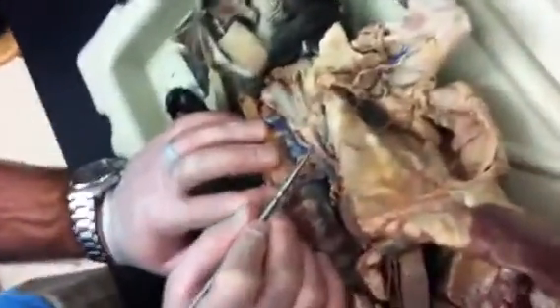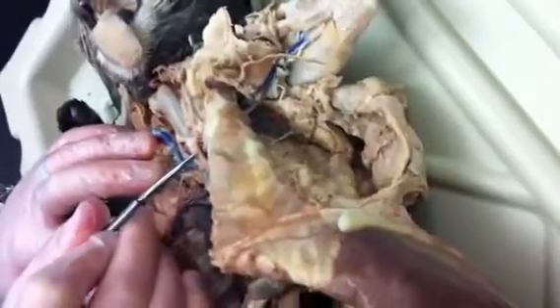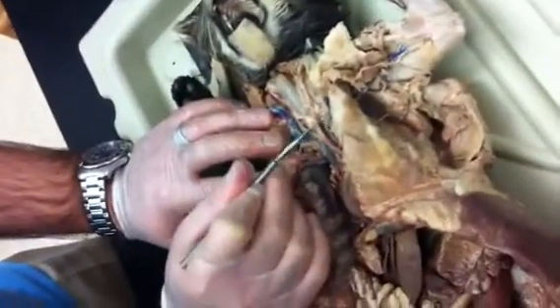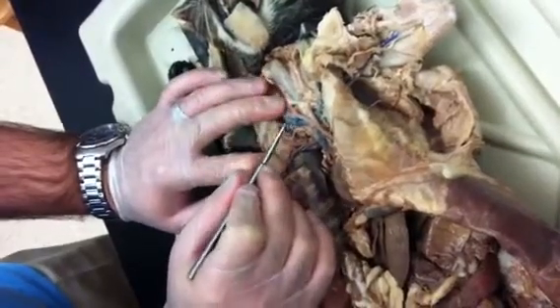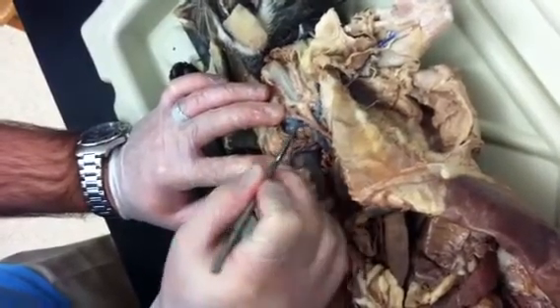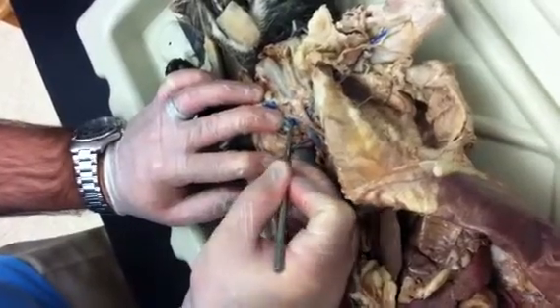Brachiocephalic trunk divides into a few vessels here. We have the carotids. I don't really care if you say common carotid. It is the common carotid, but as long as you say carotid, you're okay. But it's the left common carotid, right common carotid. And then after the right common carotid branch, we have the subclavian.